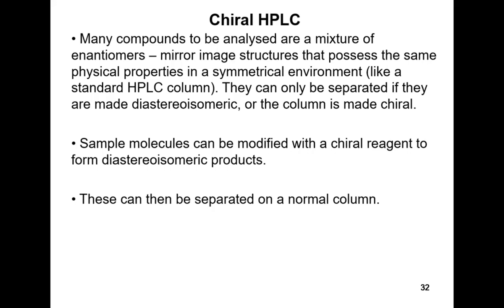There are almost spherical silica particles coated with an even layer of the bonded phase material. These opposite so-called enantiomers, the mirror image forms, are going to behave exactly the same as each other. They've got the same polarity, obviously the same molecular mass. They're going to undergo all of the same non-covalent interactions with the stationary phase and with the solvent, so they behave exactly the same as each other.